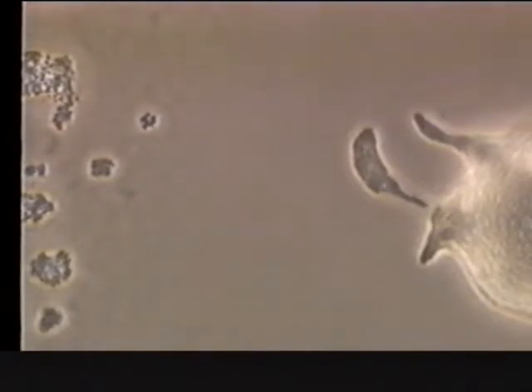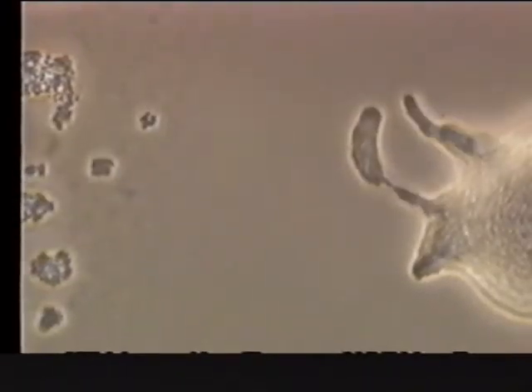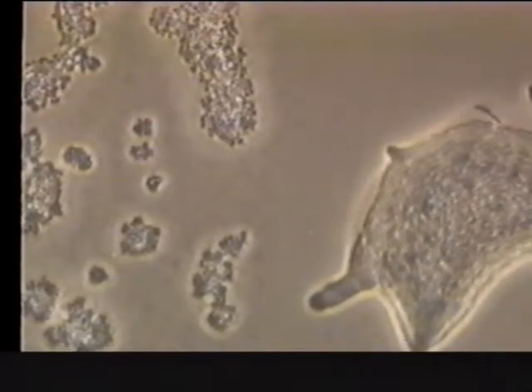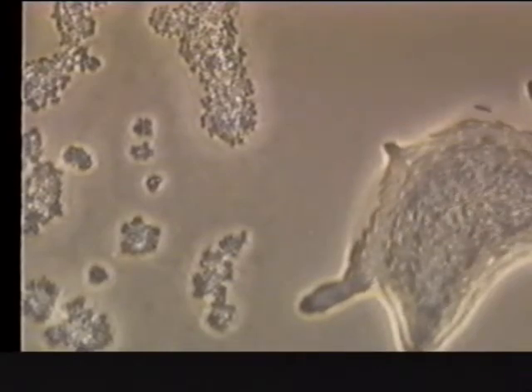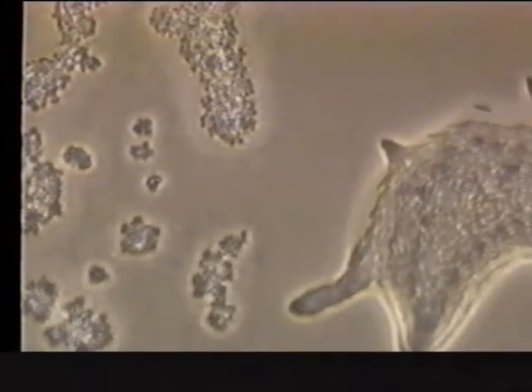Notice how the myxobacteria tend to stay in groups. Now we see at a later time where they appear now to be aware of the presence of the Micrococcus.